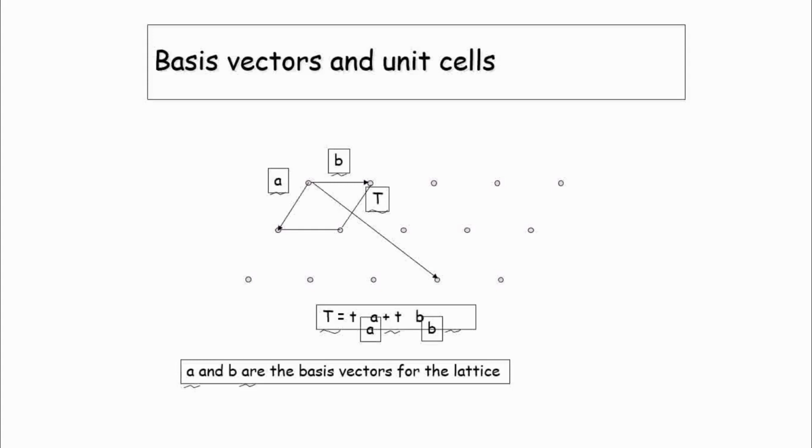Now we also have to understand that the basic unit cell has a lot of vectors. A small cube or unit cube will basically have 3 vectors. Usually it is said H, L and K, so height, length and breadth or width, whatever you want to say. The same thing is annotated here as A, B and C. It is just a form of expression. H, L and K annotations are also preferred in some textbooks, so it is up to you how you want to annotate.